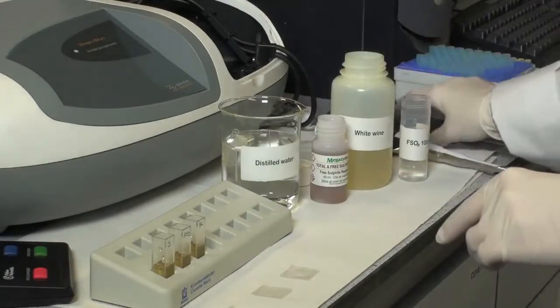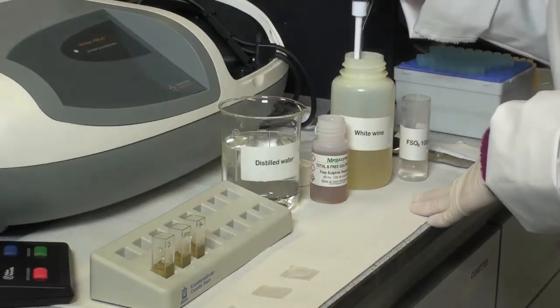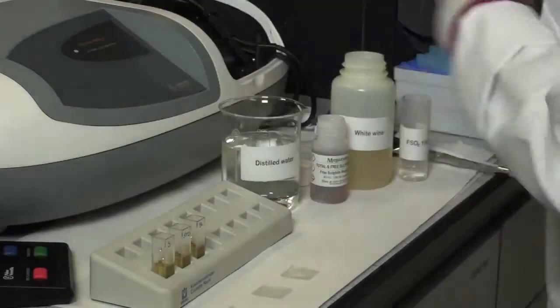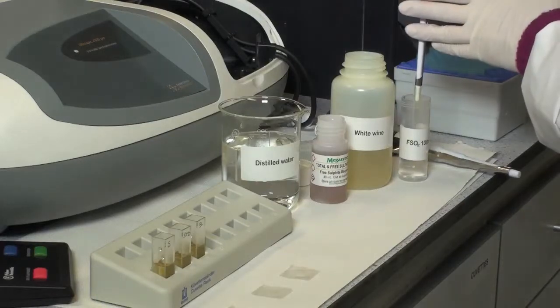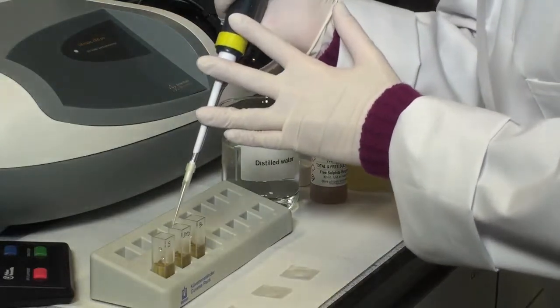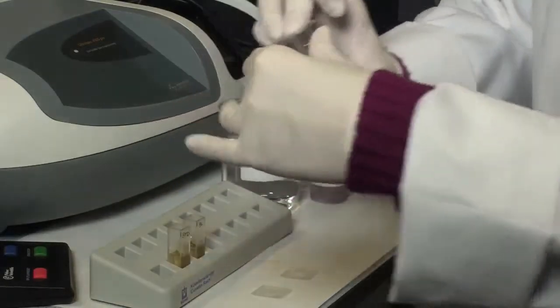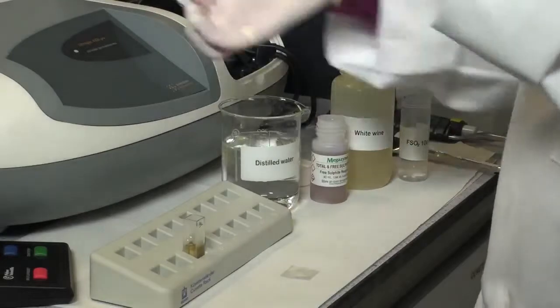Then add 0.05 millilitres of sample to the sample cuvette, and 0.05 millilitres of standard to the standard cuvette. Mix each solution, then exactly 3 minutes after the addition of sample or standard, take the absorbance reading A1 of each solution.